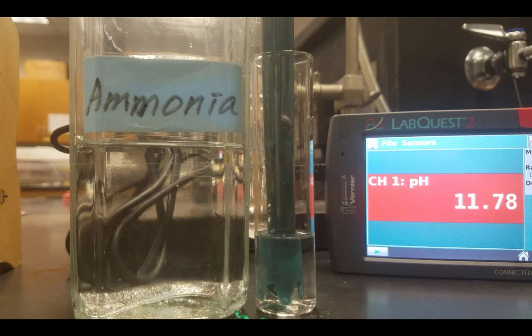Here I am testing ammonia. At 11.78 or 11.79, we should round the value to 11.8.